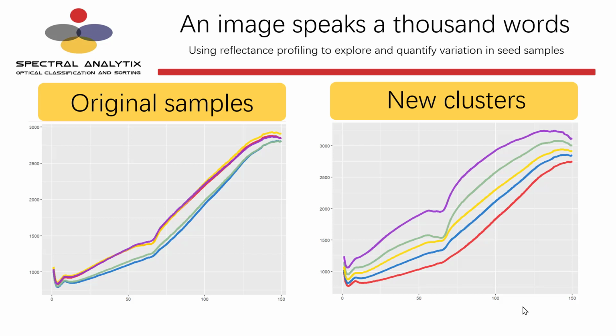This means that cluster results can be used to inform costly and time-consuming molecular and staining procedures. Time, money, and resources can be saved when such procedures are guided by results from advanced imaging analyses.